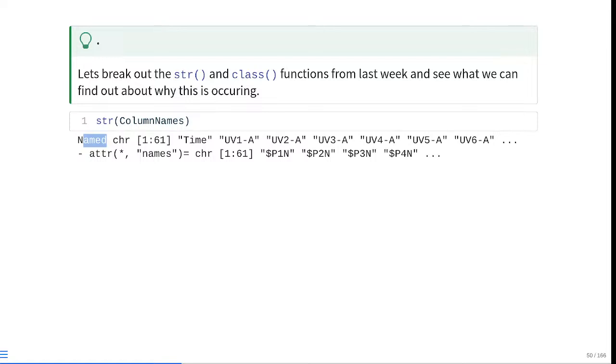So we've gathered this from context, but we actually don't know what's going on here. This is one of those areas where, if you're doing this exploration on your own, there's going to be a little bit of uncertainty. We don't have immediate context as far as what's going on. So let's just put this aside for now, and we'll circle back and try to figure out what's going on with this in just a couple minutes.